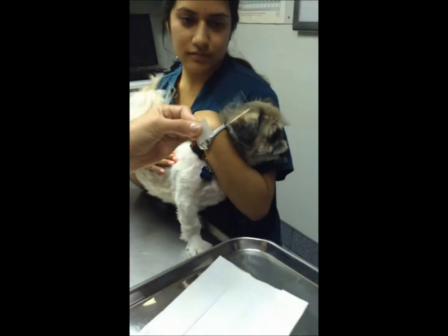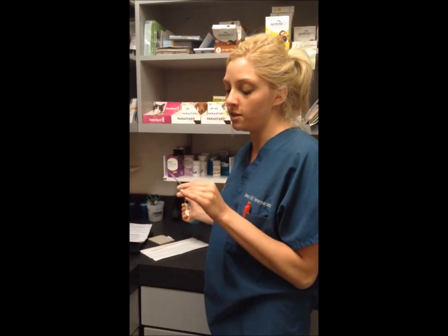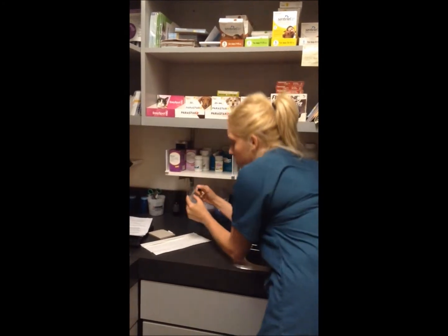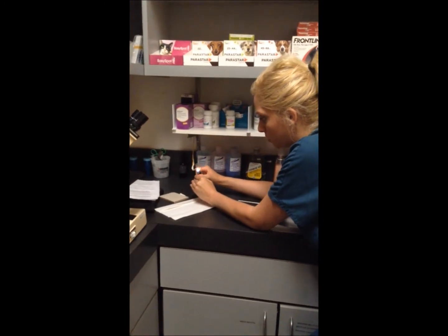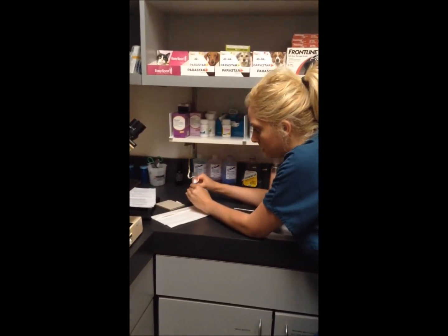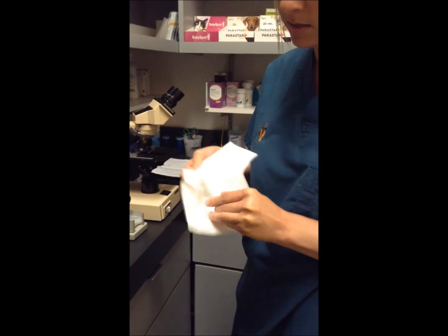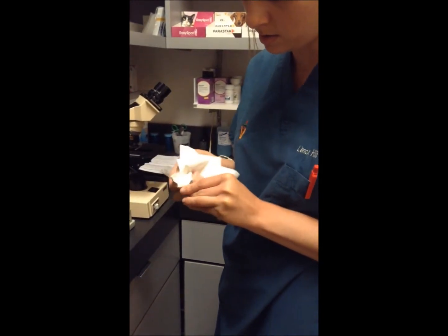There's our sample. So we're going to get our slide ready for the ear cytology evaluation. First you want to always heat fix the slide so that when you stain them, the sample doesn't come off of the slide. And you're going to wipe the bottom of the slide because the flame leaves some residue behind.